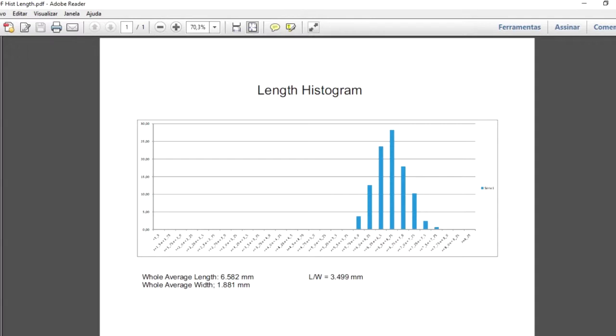The results presented by the S21 present minimum statistical deviation and a high level of repeatability. Thus, the S21 guarantees preciseness in its results.